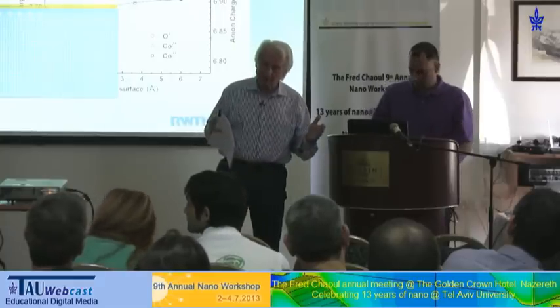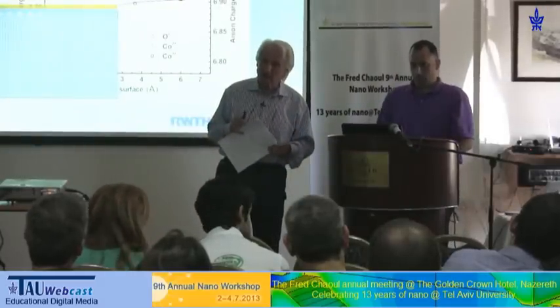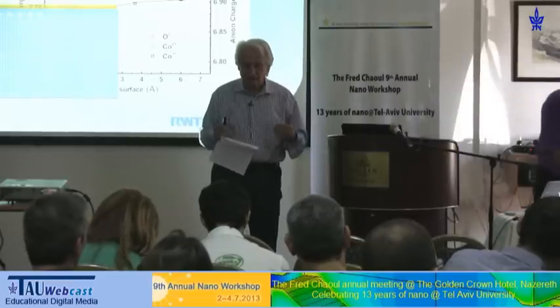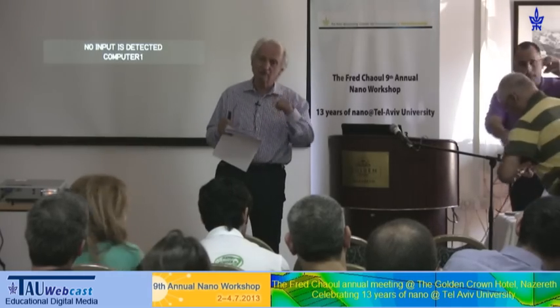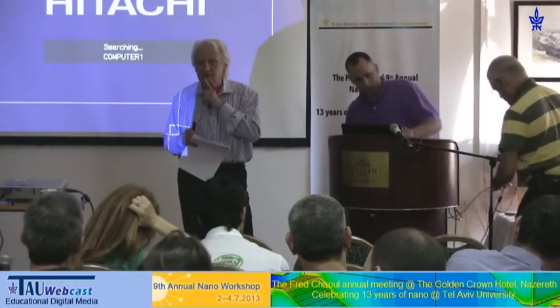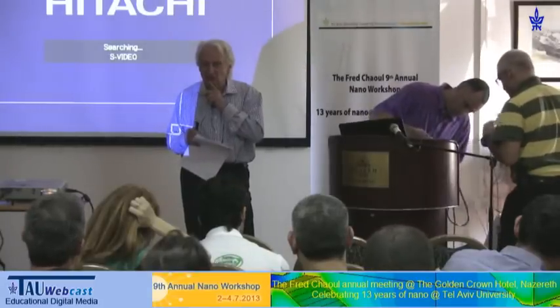And in the Pico instrument, we also have a chromatic corrector, and the Berkeley team instrument has also a chromatic corrector. It turns out in practice that we so far have not reached a chromatic correction which would really increase the resolution. And there will be a paper in PRL next month. And the reason for this is noise.